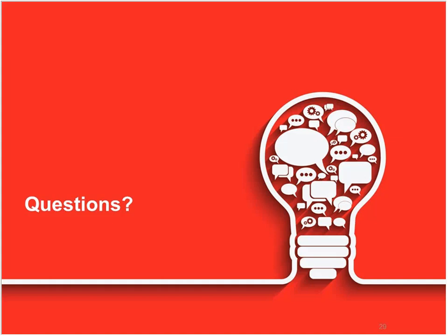Possibly. I'd have to think about that one a little more to understand exactly how to do it. You might be able to do it with the therapeutic windows in the NCA object, but I probably need the support team to dig into that a little. So I'd encourage you to ask that question on our forums, and I know that our support team would be happy to answer it, especially if you had a simple example data set to put up there. It's probably something I can't answer in a minute on a webinar.